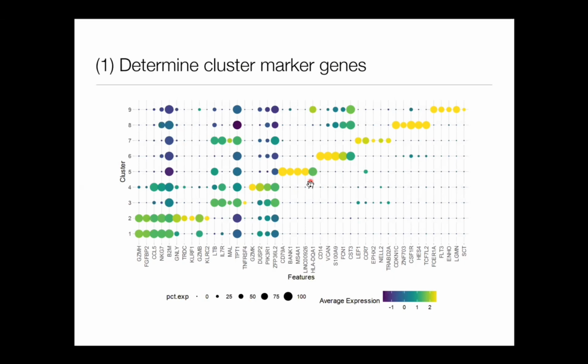It's just visual. I look at the plot and I find 1, 2, 3, 4, 5 genes. All the top 5 genes are basically almost only expressed in cluster 5, highly expressed in the cluster. Whereas here on the left side, you see we have a yellow dot, but we have nothing in the rest of the clusters. That's what I look at. And here, cluster 1 and 2, the genes that come up in cluster 1, they also come up in cluster 2.